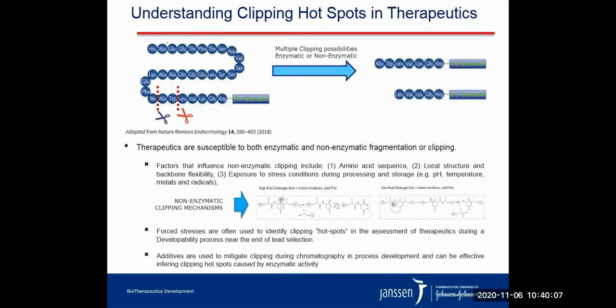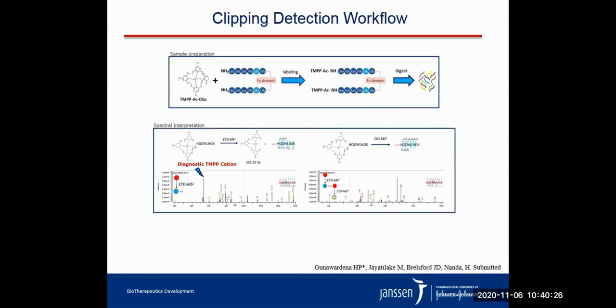Clipping can take place by non-enzymatic mechanisms as well as due to the activity of enzymes present in cell culture harvest. Identification of clip sites is challenging, and clip sites are important in the development of safe and efficacious therapeutics. Here's our workflow for clip site identification.